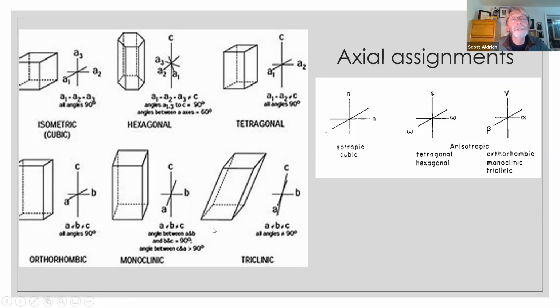A unit cell just describes, if you break it down to its base state, what sort of angles the axes would take, what the relative length of each axis would be, and the angles between those axes. And you can determine all this microscopically. So you can take a single grain and determine its crystal system and possibly its identity. Not easy, but it can be done.